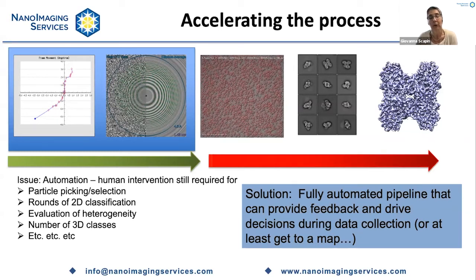There are a couple of systems that do that altogether, but when we got to the point of particle picking, we were stuck doing it by hand. And since you do it once and are done, you have to wait until the end of the data collection, which could be 2 days, 3 days. And so everything got slowed down a lot.